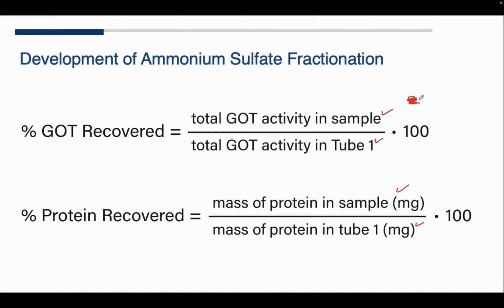We're actually looking at the activity. You can actually do protein recovered as well. We didn't do that, but we did base it primarily on the activity of GOT because that's what we're specific for. This is a really specific one. The other is a little bit more general, so not as much use, so we use this top one.